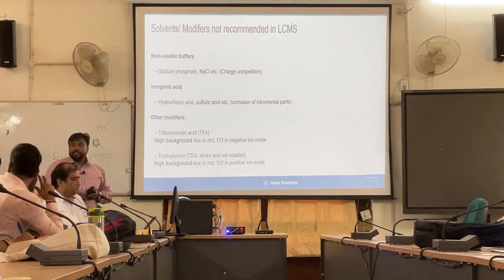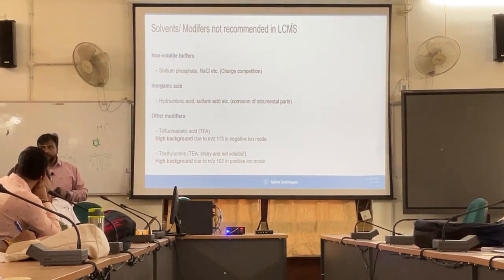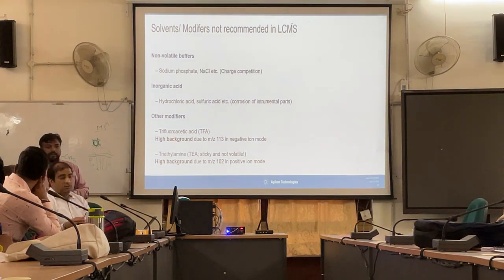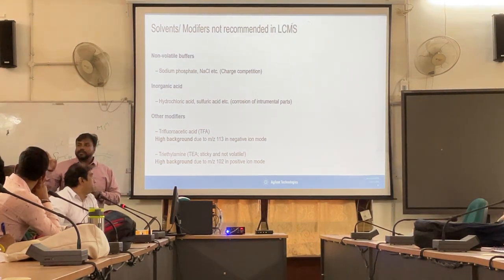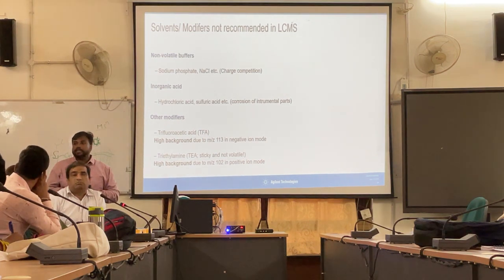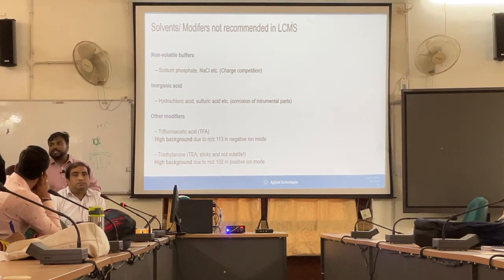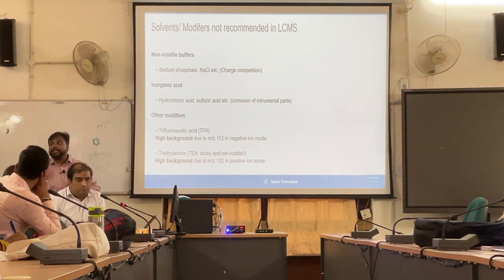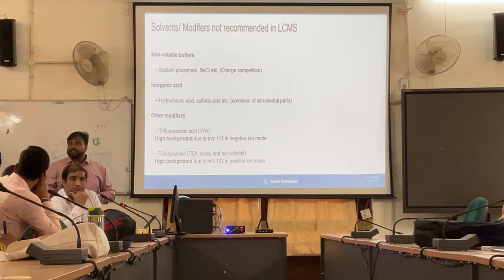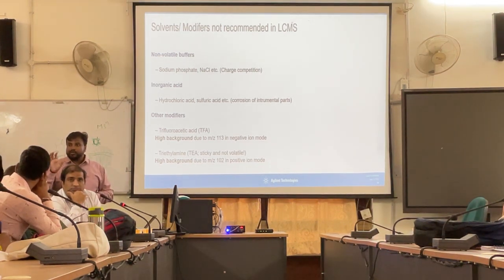Some of the HPLC experts recommend that if you are facing the problem of tailing and fronting in the peak shape, then you should use the modifier. On the chromatography side, there would not be any peak-dependent challenge with the mass spectrometry, because ultimately we are not focusing on peak shape, we are looking for ionic abundance. Once you are running HPLC, you can use whatever modifier is needed to make sure the chromatography looks better.